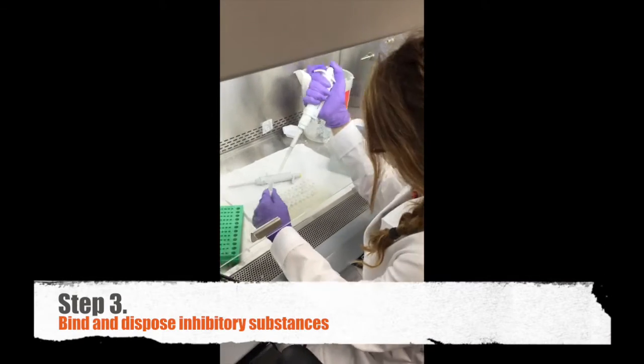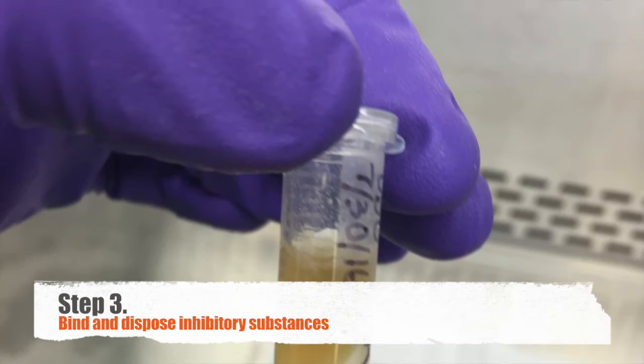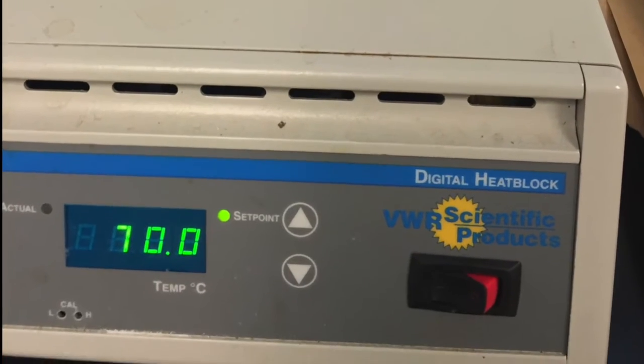Step three: I bind, dispose, and digest any extra substances that will degrade the DNA and inhibit future reactions. Then I lyse the cells again with more buffer and heat.